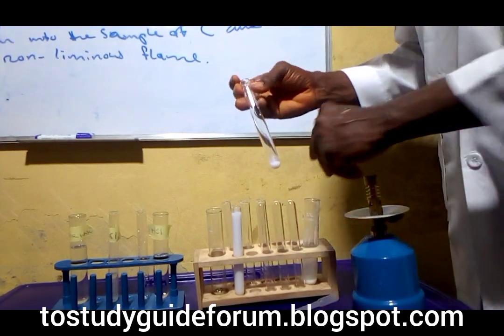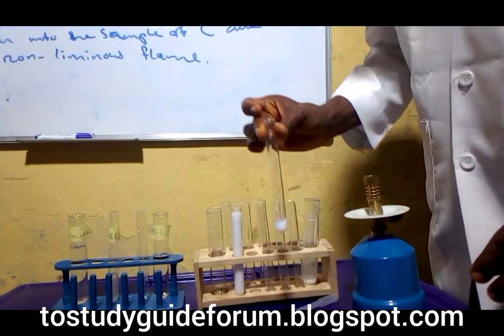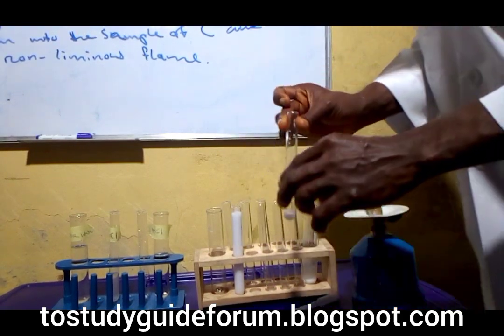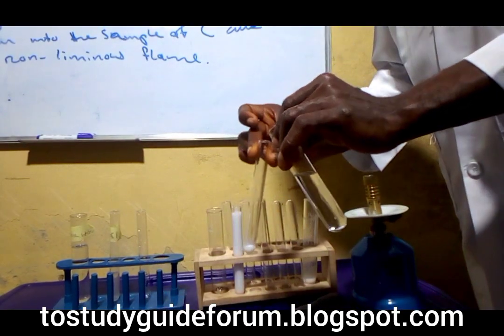Now let's carry on with what we have here. This is the precipitate we have. We are going to add dilute hydrochloric acid in excess. Dilute hydrochloric acid in excess.